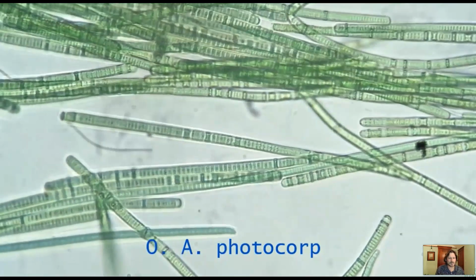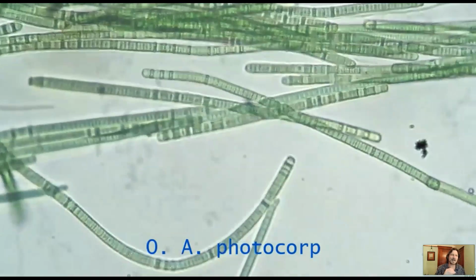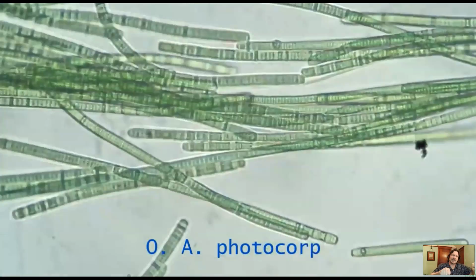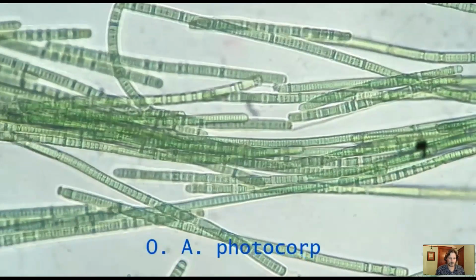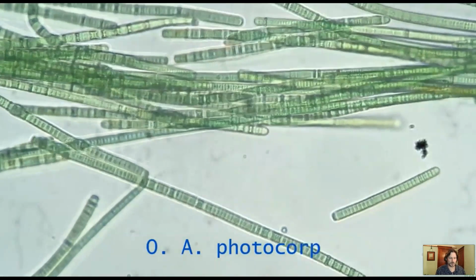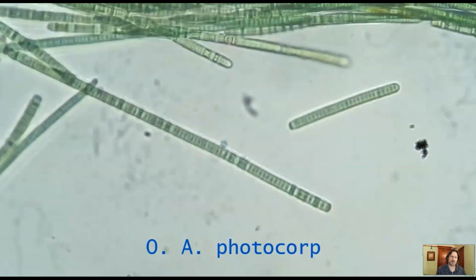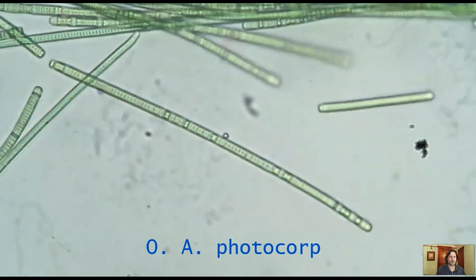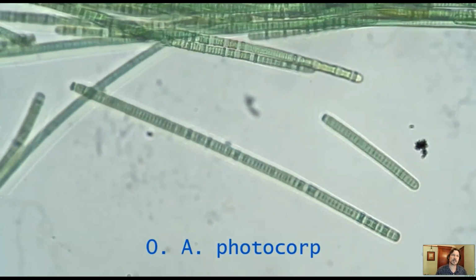I've read, and the best thing they can think of, you can see how it kind of twists a little bit as it's moving. They have microfibrils in there, and somehow they think it's actually pulling and actually gliding in its gelatinous sheath to the outside. So this is another type of movement, not with flagella, very different, called gliding movement. We'll see another organism later on, diatoms, also do a gliding movement when we get to the protists and the eukaryotes. Okay, so this concludes the cyanobacteria.